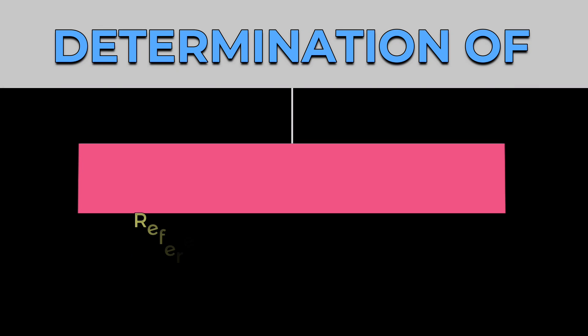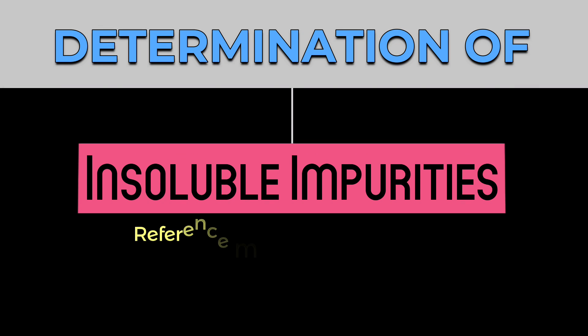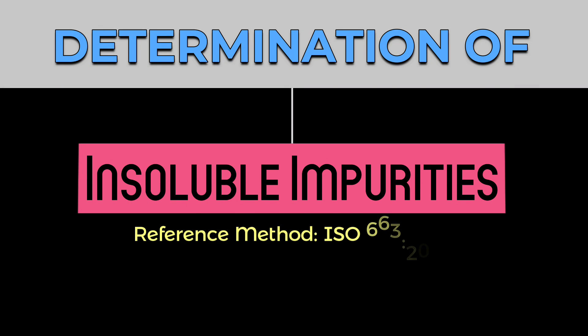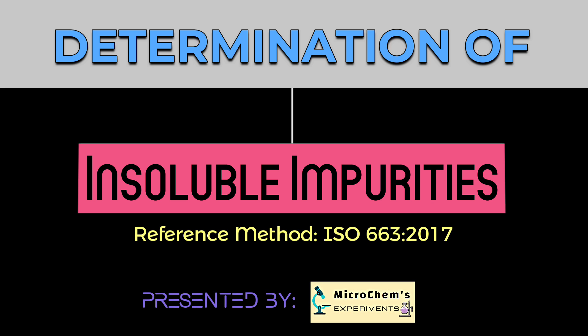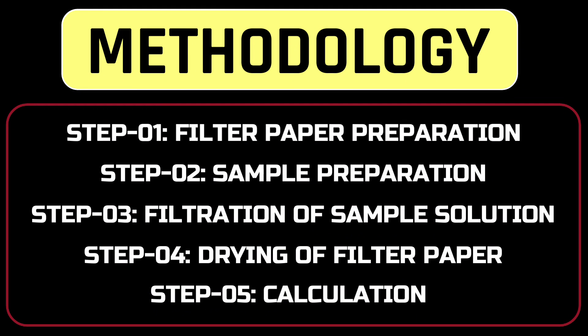Dear viewers, today we are going to determine insoluble impurities contained in fats and oils. This experiment involves filter paper preparation, sample preparation, filtration of sample solution, drying of filter paper, and calculation.